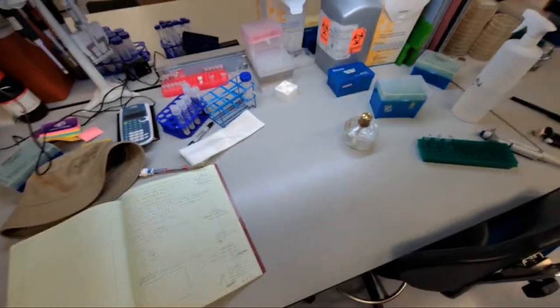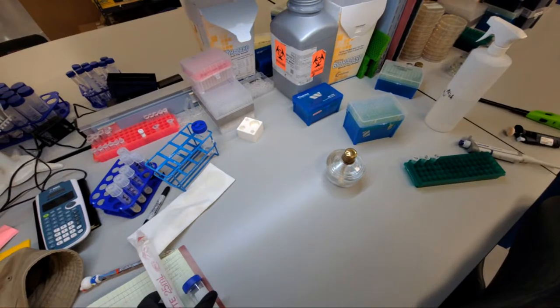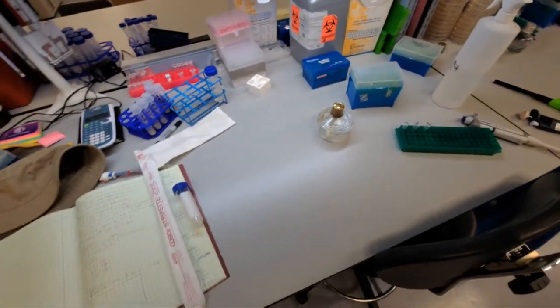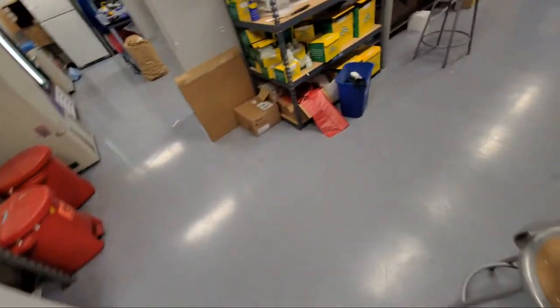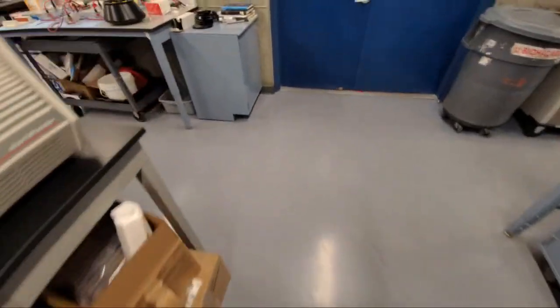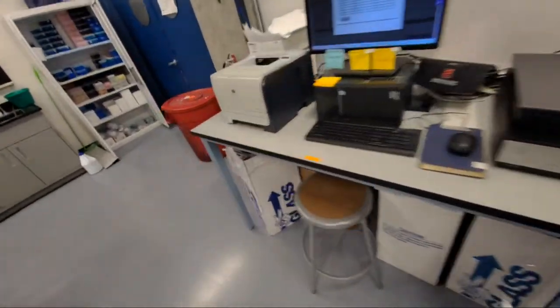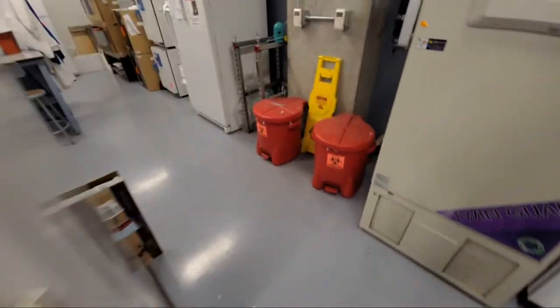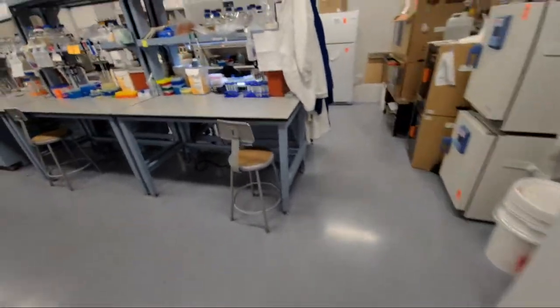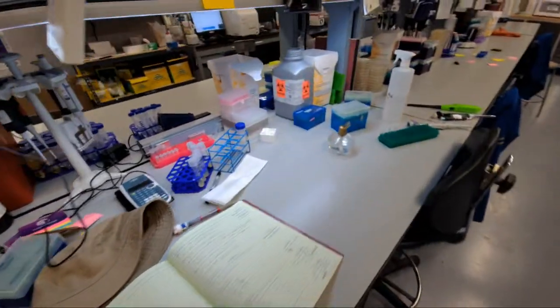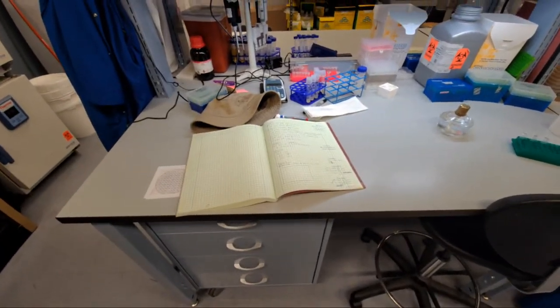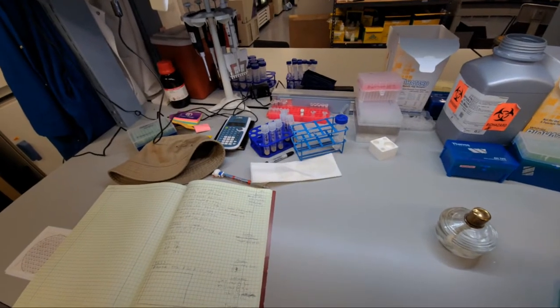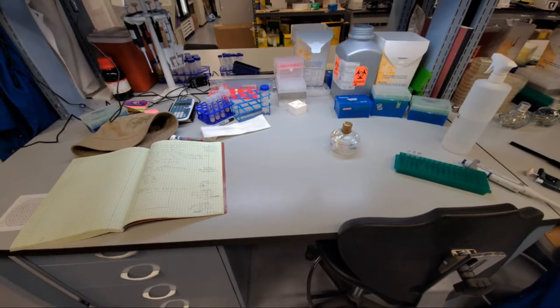Let's see if there's any chats going on here. Can you do such videos for algae growth from scratch? I don't work with algae, but there's a neighboring lab that does work with algae. I've actually grown algae before in sort of a home lab. And I think it's a more sensitive organism. It takes longer to grow. You can grow it with or without light. So there's a lot of, and there's a lot of different species of algae. So I think it's something that is similar to this. If you go back and watch some of my previous videos on like sterile technique and things like that, the sterile technique with growing microorganisms is usually the hard part.